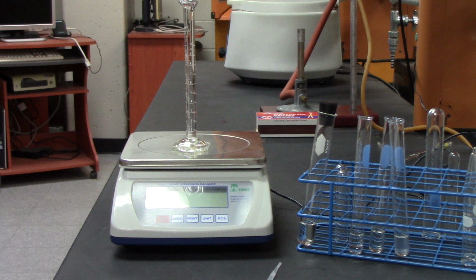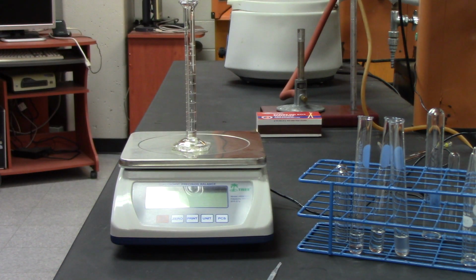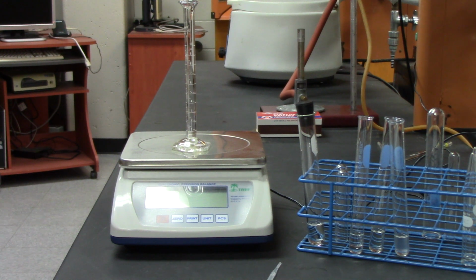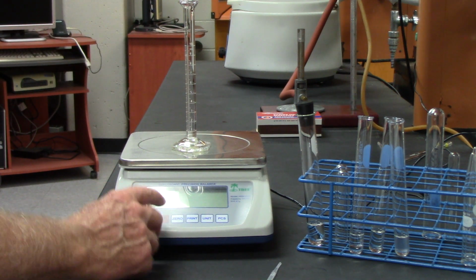Okay, so this is how we're going to measure the mass and the volume. Okay, so I have my unknown here. And what I want to do is measure the volume and measure its mass for that volume. Okay, so first thing I'm going to do is put the graduated cylinder on the scale.